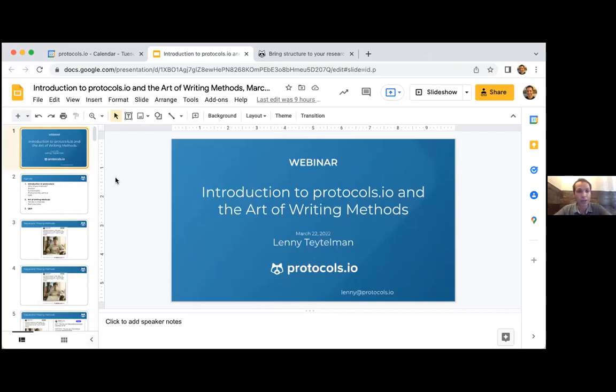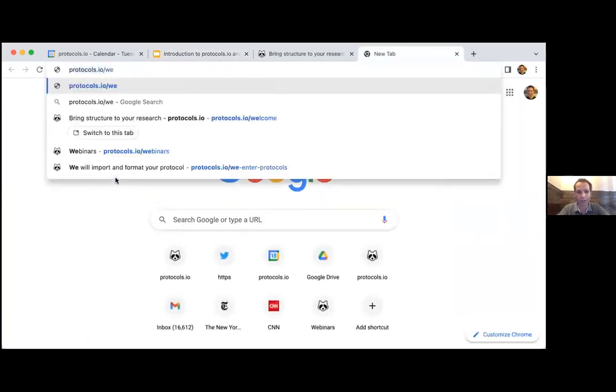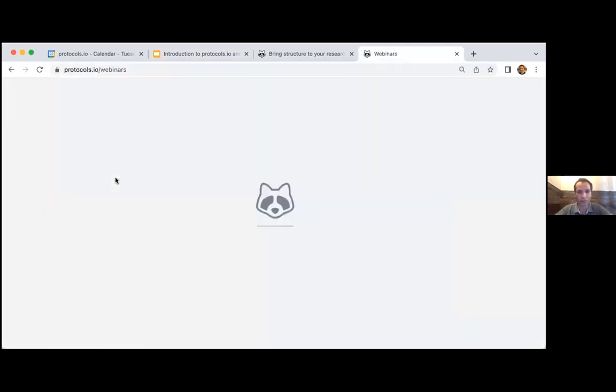So in this webinar, we'll go over some of the more general things in terms of the motivation behind Protocols.io and what our mission is, some of the basic features, and just orient people. So this is meant for folks that are not power users of Protocols.io. And obviously, we won't have a chance to go through everything in terms of functionality that we've been adding to Protocols.io since we launched in 2014.